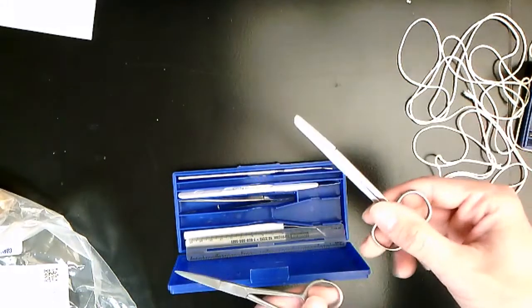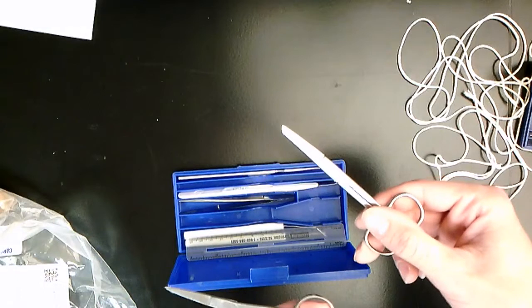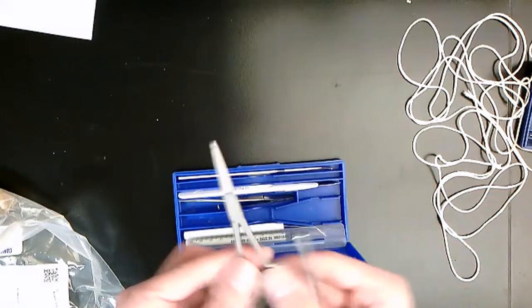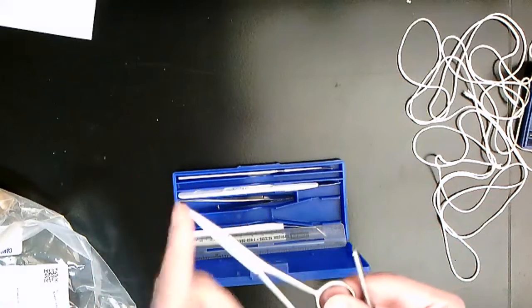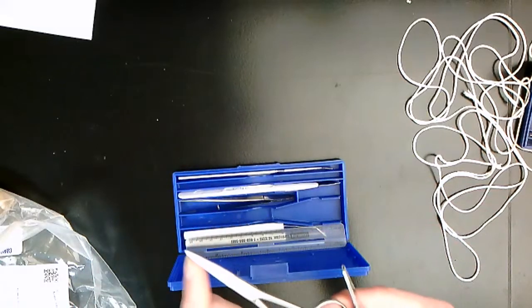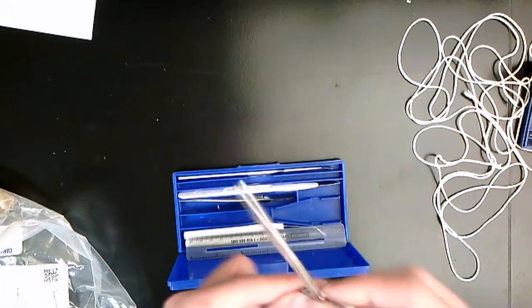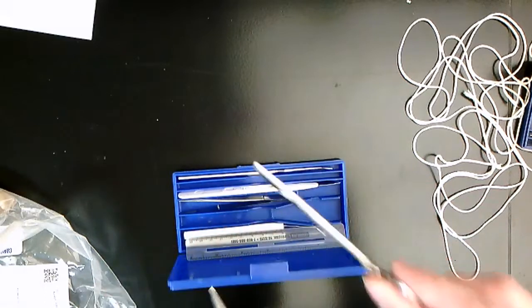So it's really just going to depend which station your students are placed at to which type of scissor they have. So you may want them to prepare and practice with both, because if your student gets the kits that have the pointed end, it's a lot easier to pierce the organs as you cut versus the rounded end that you can make the point face upward.